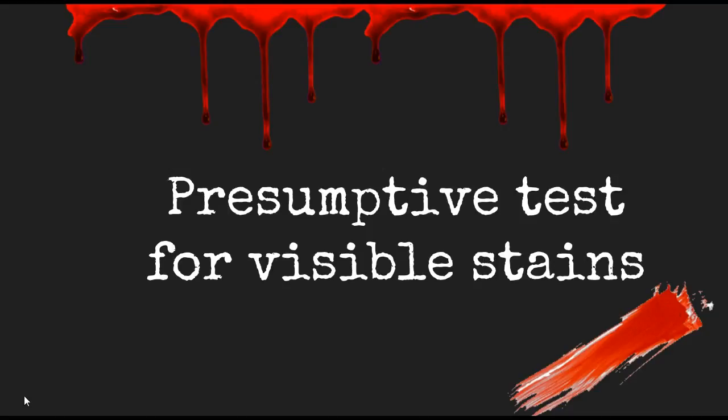So again, remember what a presumptive test is. A presumptive test tells us what something likely is, or it tells us what something definitely isn't. They're usually quick, they're easy to learn, they're easy to interpret, and they don't require a lot of special things. And as we learn about this test, you'll see that this definitely satisfies that requirement.